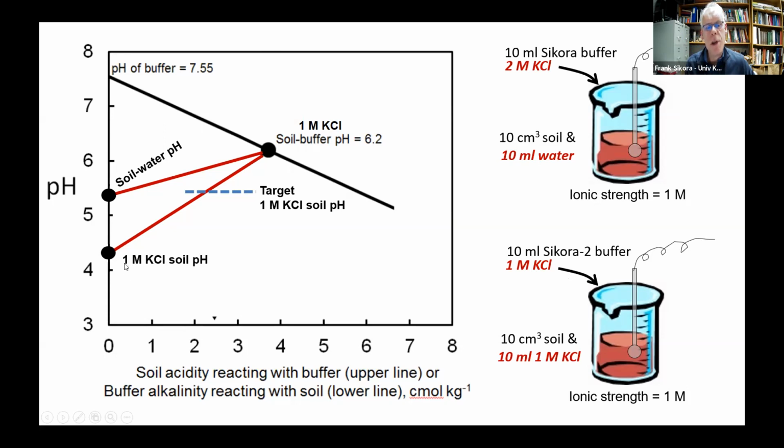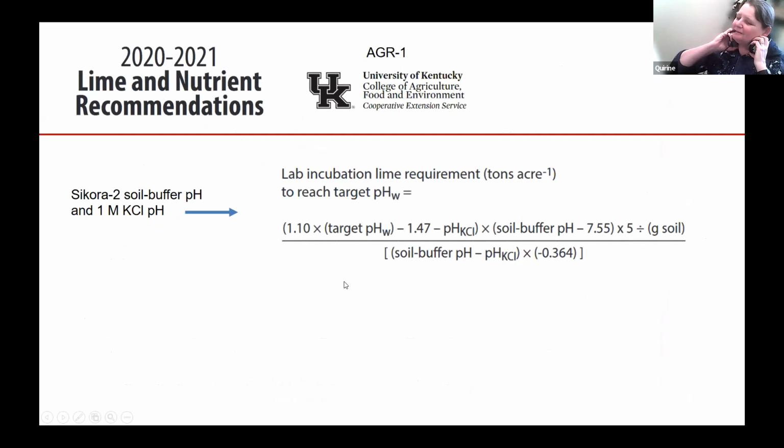So that was the reason the high salt concentration was introduced in this method. And it had a side benefit of getting a salt pH, with all the benefits that were discussed a month ago when we looked at the advantages of salt pH. All right. Sounds good.